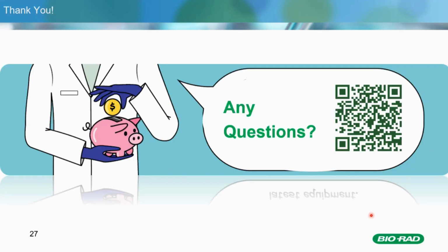So it's really a quick and easy approach to get your results and to normalize using stain-free images and ImageLab software, and I hope it will help you to get high quality data.